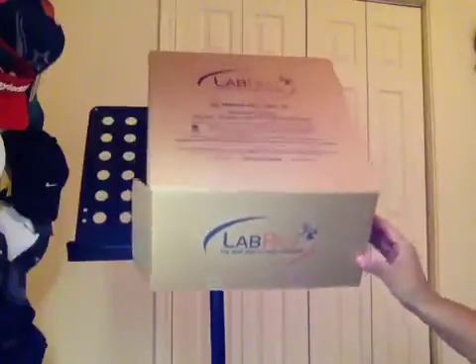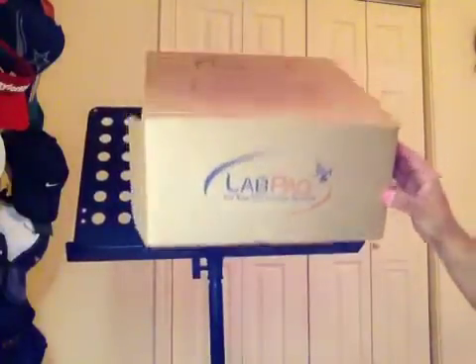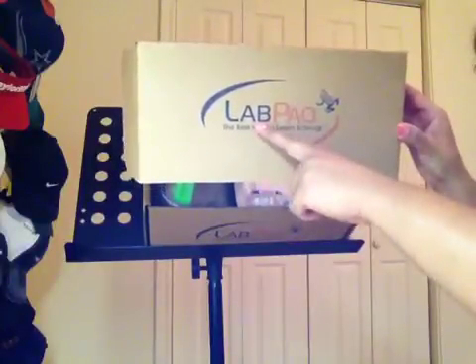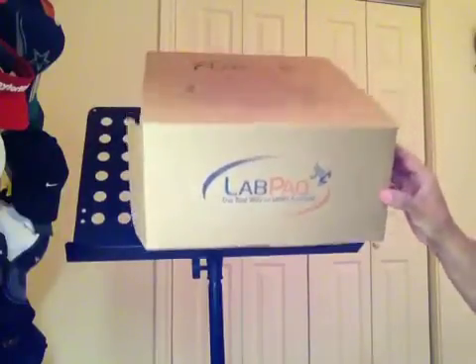I wanted to go over with you one of the materials that you're going to need in order to complete the laboratory course, and that is the lab pack kit. This is a small scale production video here. Here's a lab pack kit — I received mine in the mail yesterday. It was packed in a bigger box, and in the bigger box was a smaller box. What you're going to hear me pronounce over and over again is the word lab pack, L-A-B-P-A-Q. That's how it's pronounced — lab pack. I wanted to go over the contents of what's inside with you.